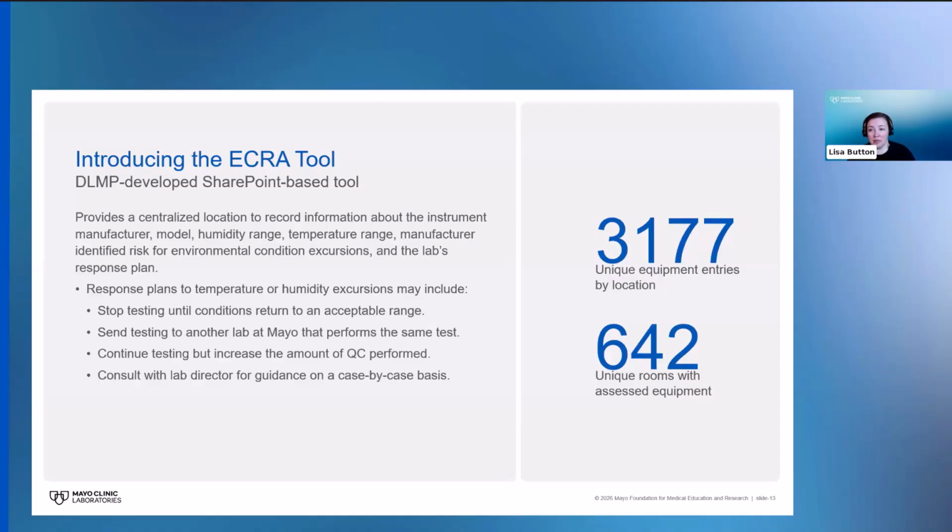We are able to put in the instrument manufacturer model, humidity range, temperature range, the manufacturer's identified risk for environmental condition excursions, and what the lab is going to do about it if we were to go outside one of those thresholds.